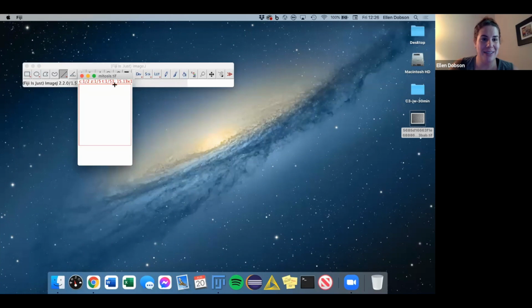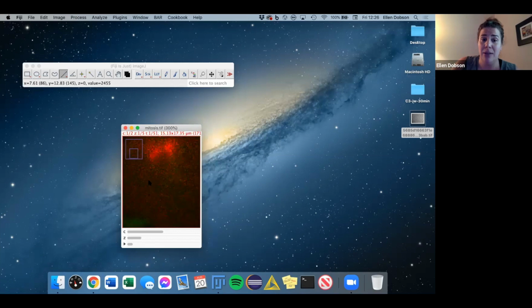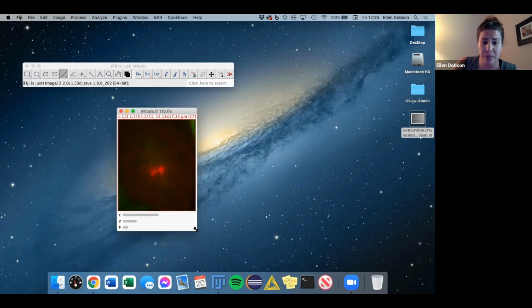Sorry, guys. Right now there's no zoom factor shown because I didn't zoom, but you can actually zoom quite easily over an image if you move your cursor and just hit the plus or minus buttons. That's the quickest way of zooming in. If you move the cursor, it'll zoom into wherever the cursor is, and then you can see the zoom factor above.